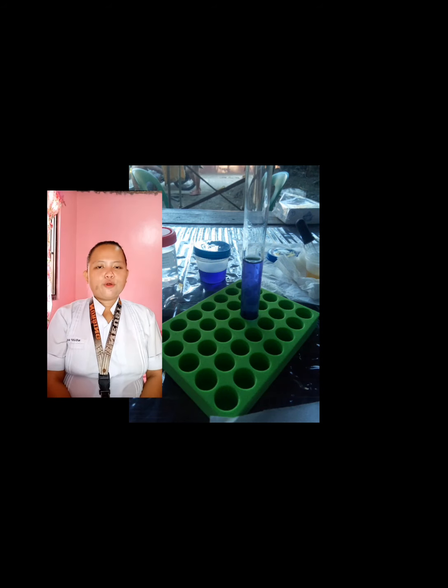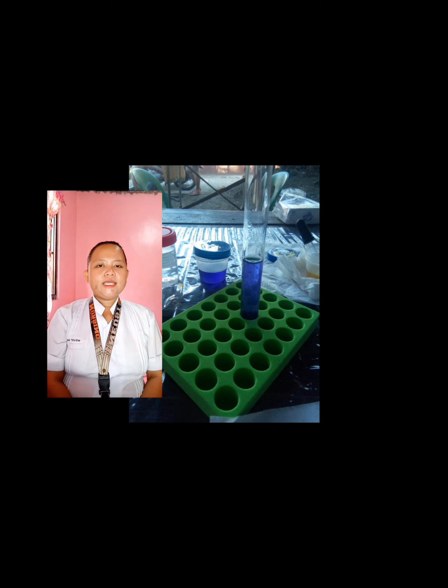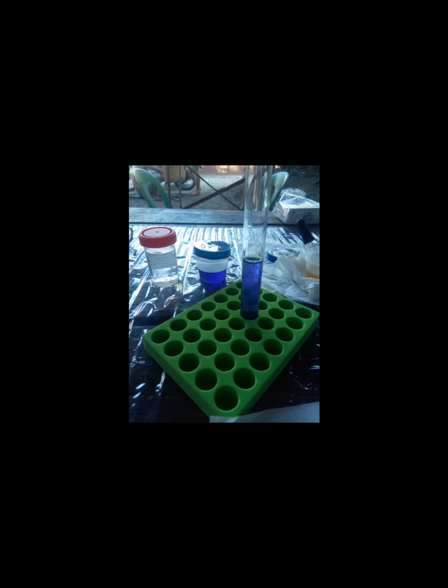The following color changes may occur and indicate the following results: blue indicates a negative result; green indicates 0.1 to 0.4 percent; yellow indicates 0.5 to 1 percent presence of sugar; orange indicates 1.1 to 1.5 percent; red indicates 1.6 to 2 percent; and brick red indicates 2.1 percent and above. As we can see, the color of the result is blue, which indicates that the results are negative.